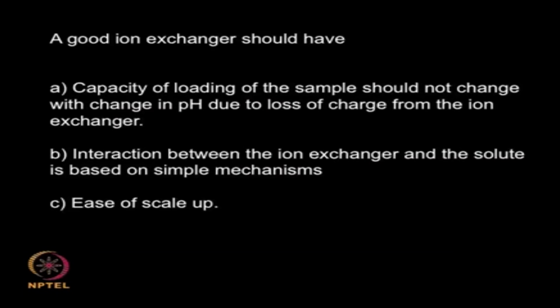A good ion exchanger should have a loading capacity that does not change with the change in pH, or due to loss of charge from the ion exchanger. Interaction between ion exchanger and the solute should be based on a simple mechanism.